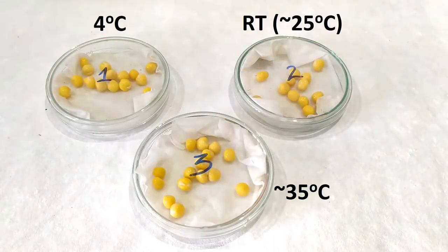Place Petri plate 1 at 4 degrees Celsius by keeping it in the fridge. Place the second plate at room temperature. Place Petri plate 3 at about 35 degrees Celsius by keeping it inside an incubator or in a constantly warm place.